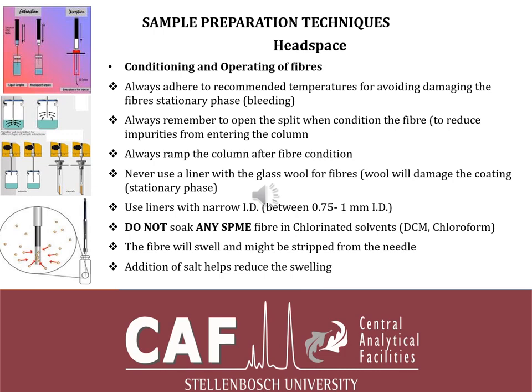Also, never ever use a liner with glass wool, because that will definitely damage the coating on the stationary phase of the fiber. And when working with SPMEs, bearing in mind that you're already working with a very minute sample, because it's on the fiber, the liner that one has to use has to be a narrow bore liner. Anything between 0.75 to 1 millimeter. Sometimes you can even go to 2 millimeter internal diameter for the liner.